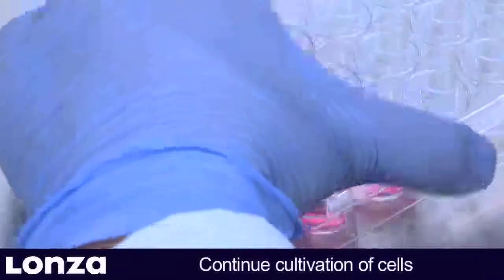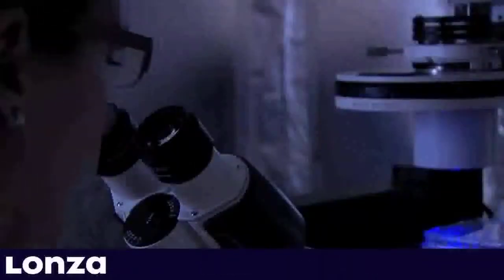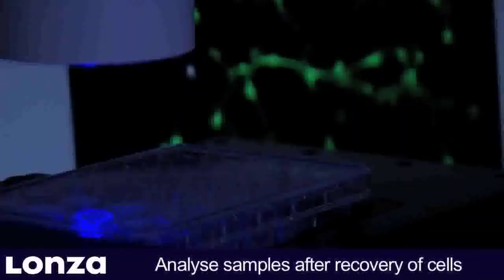Now place the culture plate into the incubator and continue cultivation. Before analyzing the transfected neurons, allow the cells to recover for at least 24 hours.